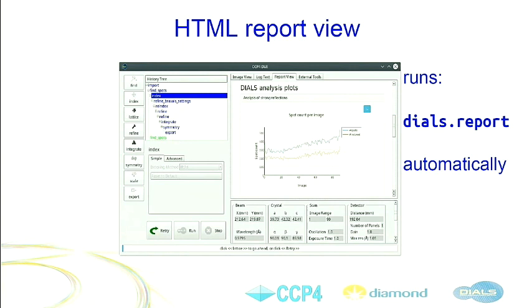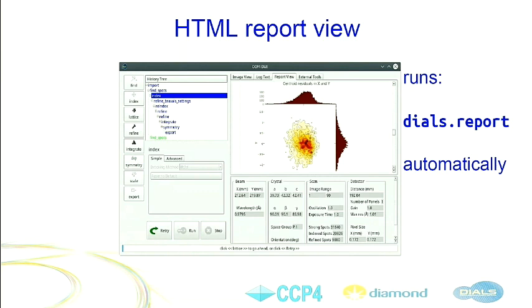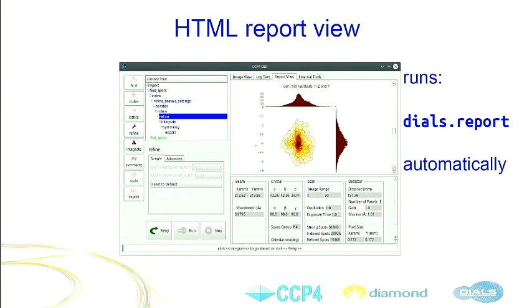There are more graphics to show in the report. Another graph shows the difference between the model and the spots found in the image. After indexing it looks a certain way, and after refine and re-index it looks a bit sharper — it's something you should look at. If it looks slightly wide, that's not bad. But if there are two Gaussians more than a pixel or two apart, then you should worry. There is more to see in the report view — come tomorrow to the lunchtime byte.